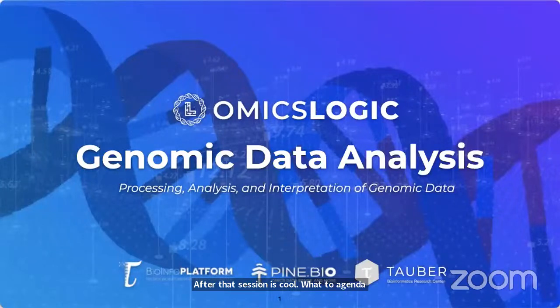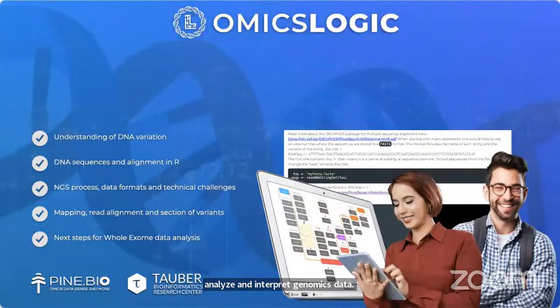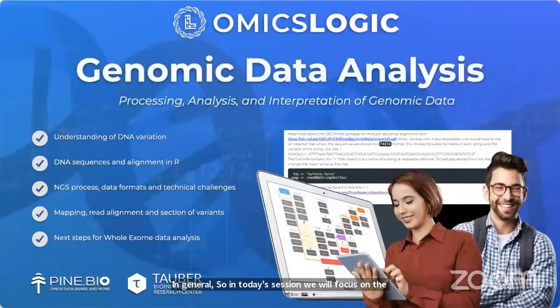Welcome to the first session of Genomics Data Analysis, where we are going to discuss how we can process, analyze, and interpret genomics data in general. In today's session, we will focus on the DNA code itself, and on how to interpret the variation. That is the main focus of analyzing these DNA codes, and what are the different ways in which these variations can help us understand the biology behind the study samples that we are investigating.